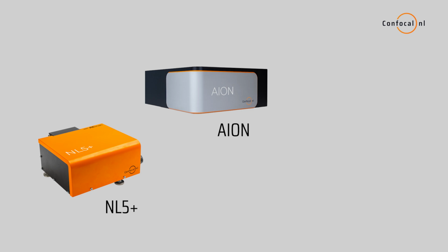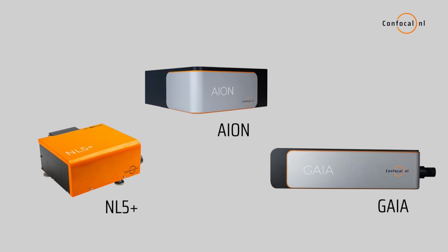Welcome to the tutorial on using the Rescan Confocal microscope, or RCM unit, with the open source platform for microscope imaging, Micromanager. Micromanager supports multiple platforms, Windows, Mac and Linux, and provides an open plugin interface for adding new devices. Combined with ImageJ, Micromanager provides a full-featured microscope management and image processing package, comparable in capabilities to commercial solutions. It is distributed free of charge and under an open source license.